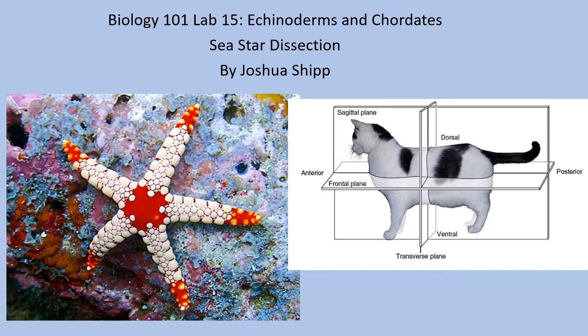Now, the first thing to recognize about a sea star is that they are echinoderms, and because they are echinoderms, they have pentaradial symmetry. Basically, their body parts are multiplied 5 times around a central axis. There are 5 different ways you could slice them in half, and they would have the same structures on both sides of the slices. So they have a form of radial symmetry.